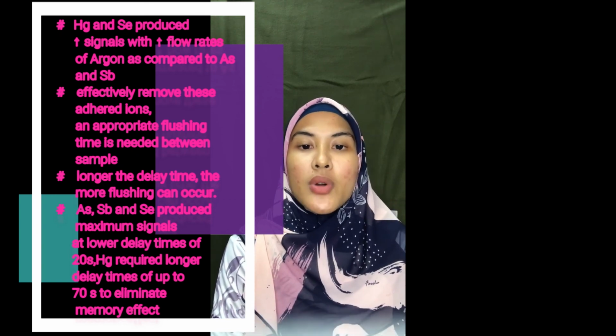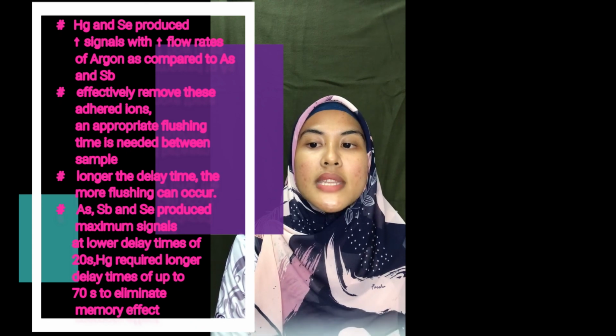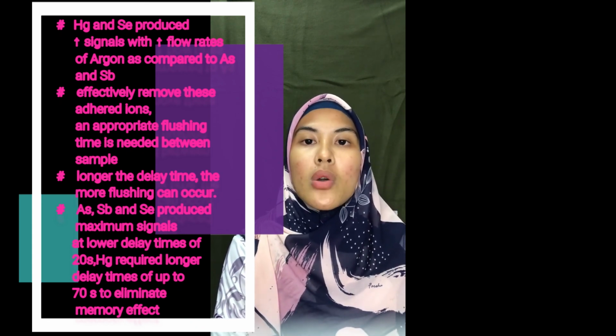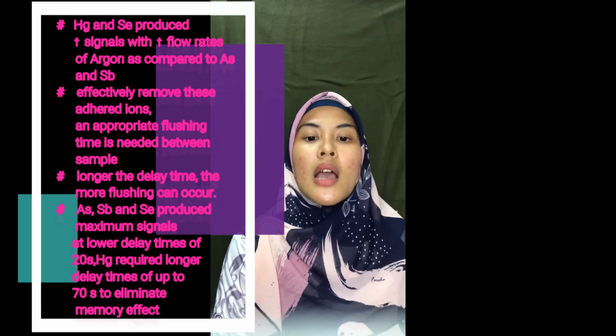Arsenic, antimony, and selenium produce a maximum signal at lower delay time of 20 seconds, while mercury required longer delay time up to 70 seconds to eliminate memory effect. That's all from me.